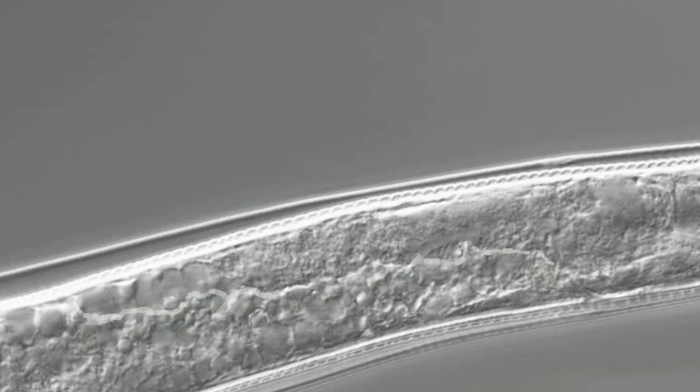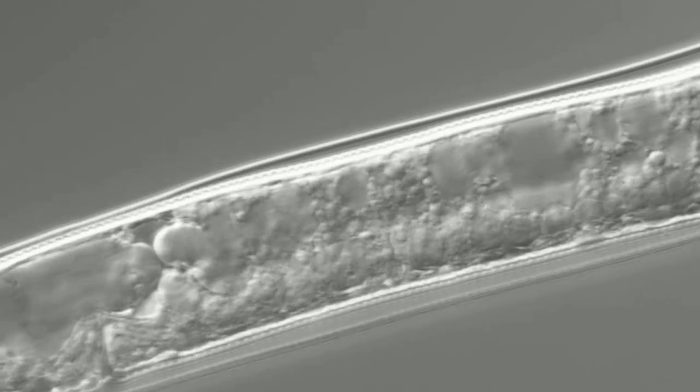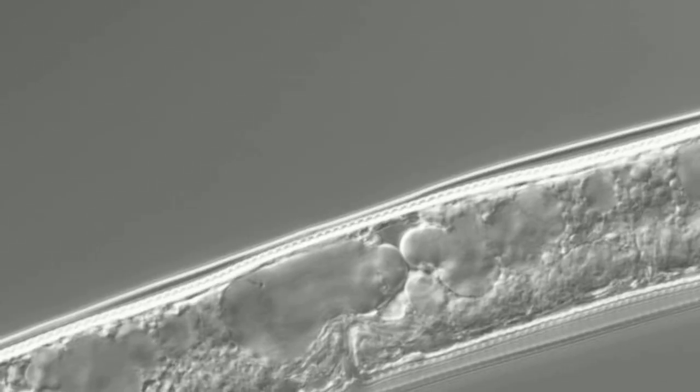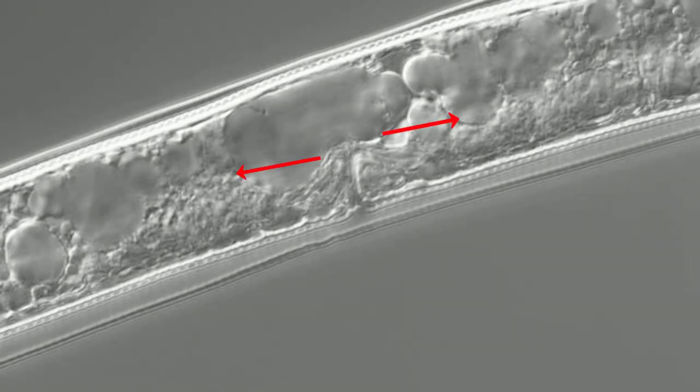As we continue moving posteriorly, we come across the anterior branch of the female reproductive system. This reproductive system is didelpic, with two branches that stretch to both the anterior and posterior sides of the nematode respectively. Right now we are seeing the vulva of this nematode, which is located at around 50 to 70 percent of the body.